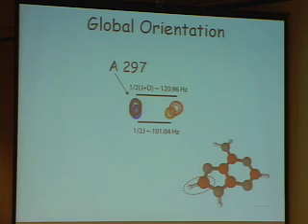So as a result, when we obtain many carbon-hydrogen vector angles, we can then gain insight into other physical parameters such as RDCs. And when we have a lot of these, we're able to relate one end of this B duplex relative to the other. So by this method, we can obtain a high-resolution structure of RNA. And in this case, it was the B duplex.